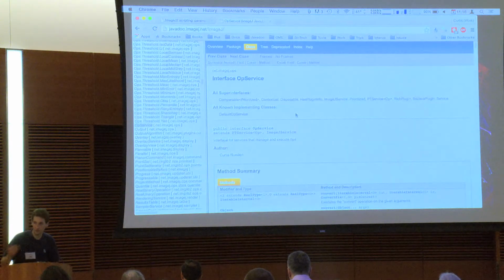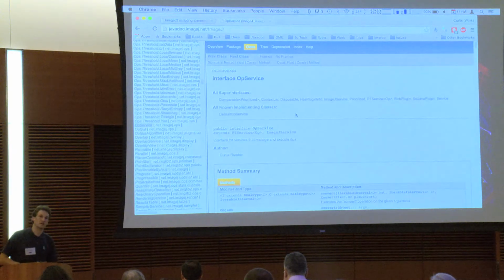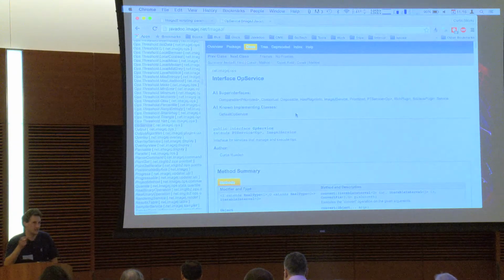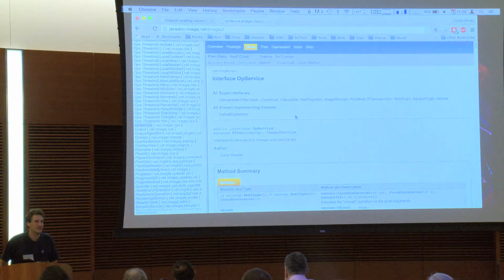It was almost for answering this question of how do I know what's there? Instead of looking through a huge list of just names, you might want to say, well, what sorts of things can I do? Just like the services, right? I can do math things, I can do stats things, I can do things on images. And then for each of those, you can look through the list. So far, I have militantly resisted people who want nested namespaces. I hope that doesn't happen, because then you're back to where you are with packages, and it's like, well, which package do I look in?